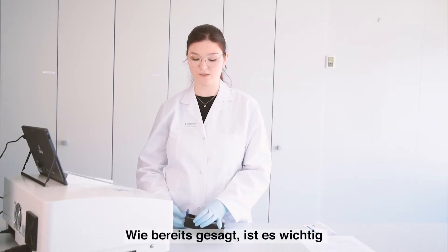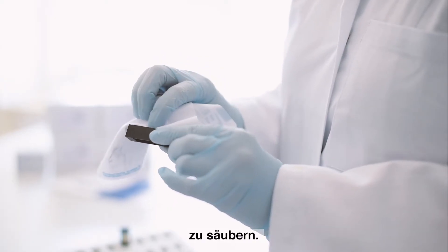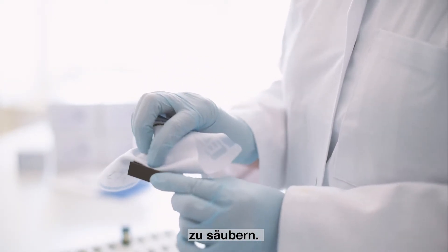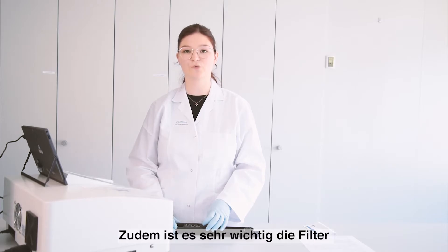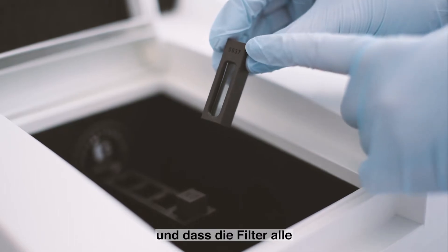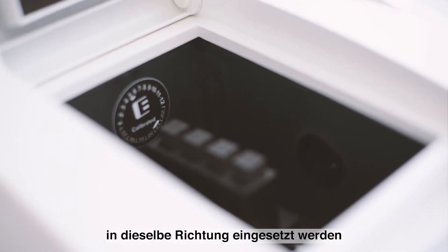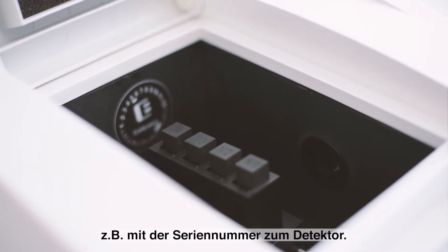The filters should be cleaned with a lint-free cloth before inserting them into the instrument. The filters should be placed correctly into the light path. This is very important and the filters should always face the same direction, for example with the serial number towards the detector.